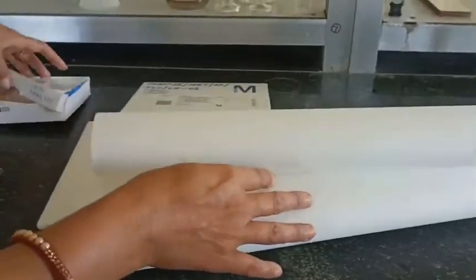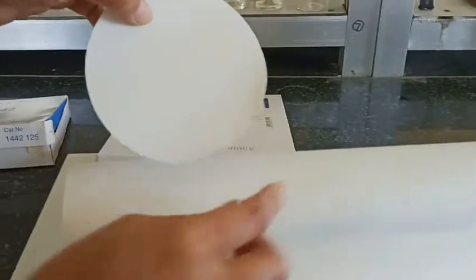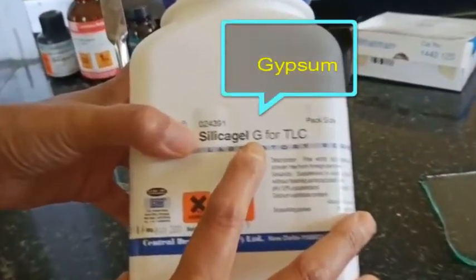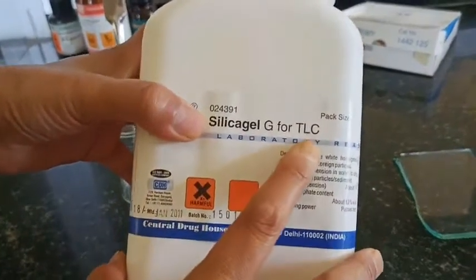This is Whatman filter paper, and here we have a sheet of Whatman filter paper for TLC purpose. Here we also have the glass plate on which we are going to prepare the TLC — thin layer chromatography — with silica gel G. G stands for gypsum, which acts as a binder.